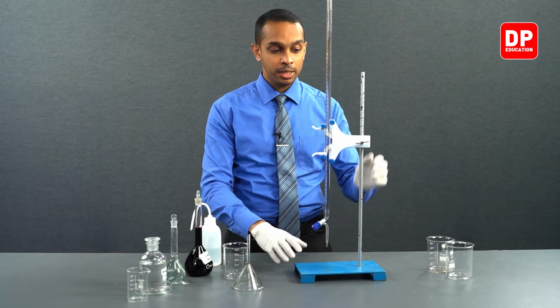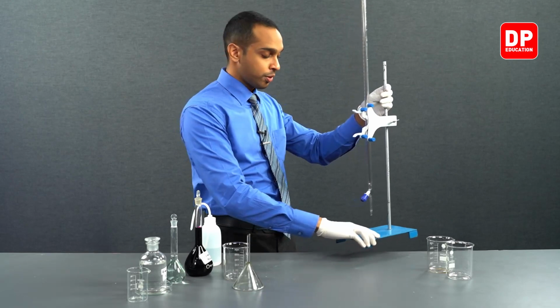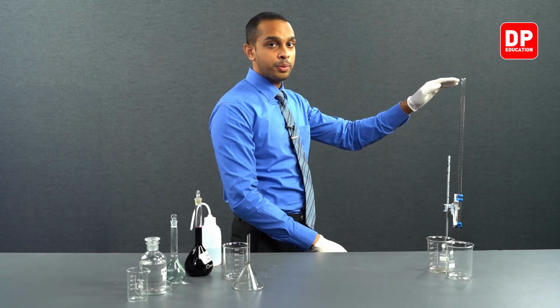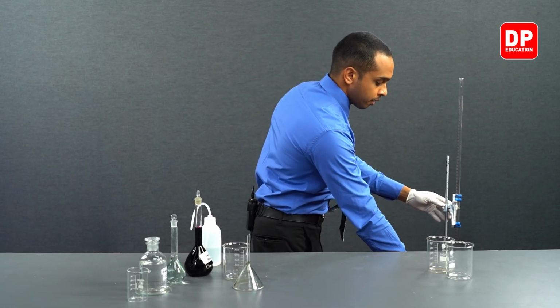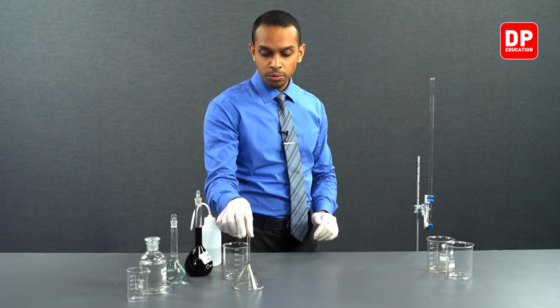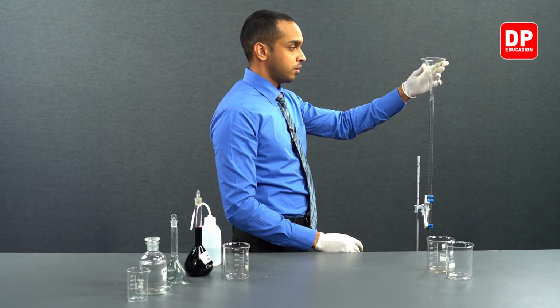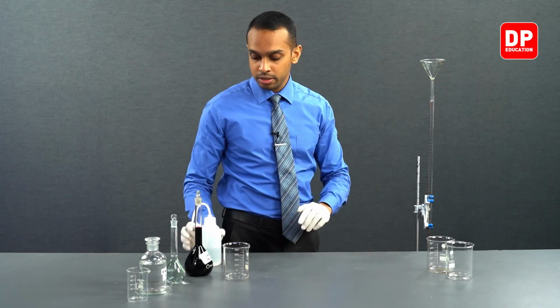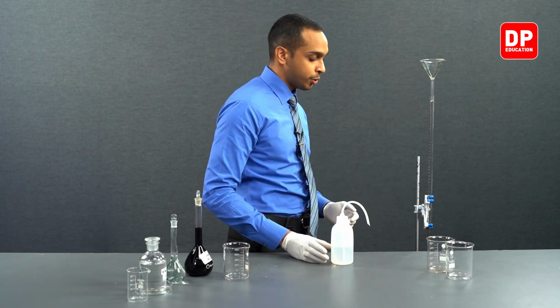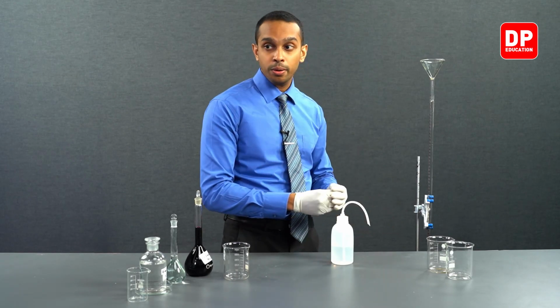So what you do is you find a stool or a table that is shorter than the lab table, and we will move the burette onto that table. So now the opening of the burette is below your eye level. So now you can take a funnel, place the funnel on the opening of the burette, and transfer some water onto the burette. While doing so, please make sure the burette tap is closed.